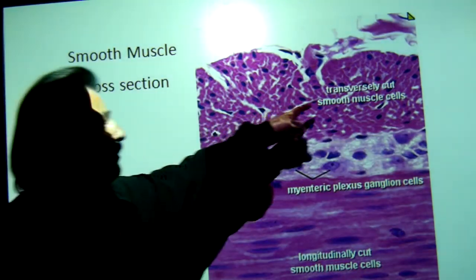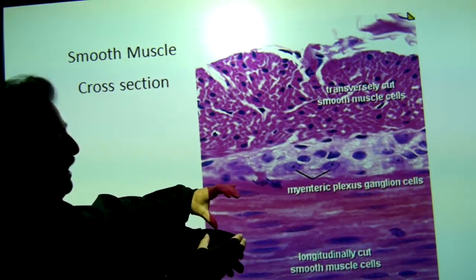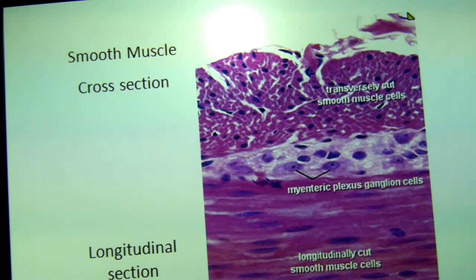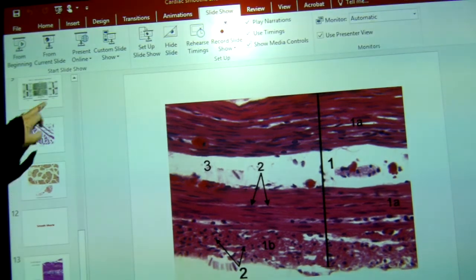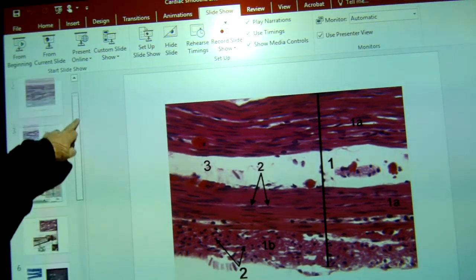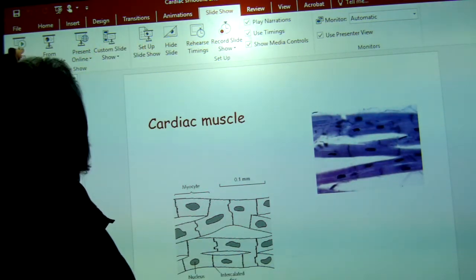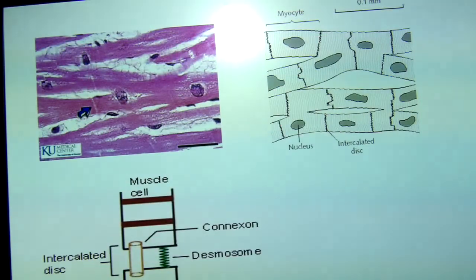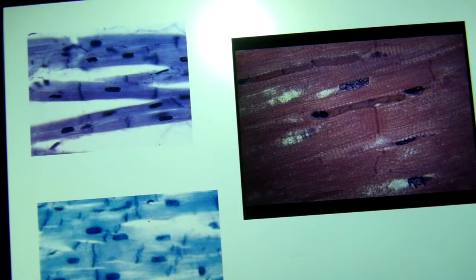So transverse cut, that's basically taking this and then pulling it back so you can look at it. That's what that would be right there. All right. So for the most part then, you got your cardiac muscle with its non-linear stuff right there, intercalated discs made up of desmosomes and gap junctions.